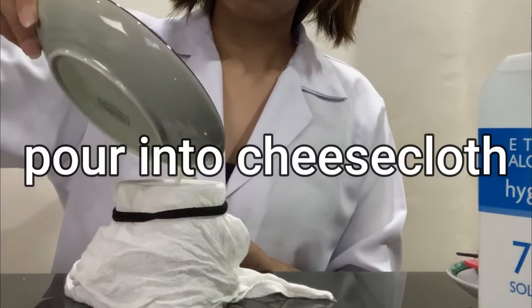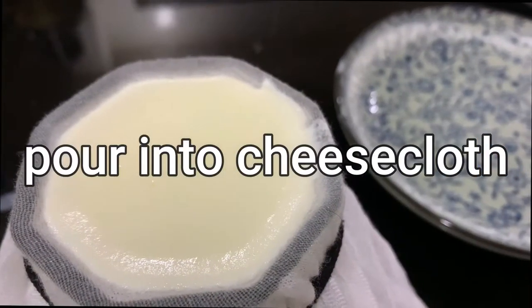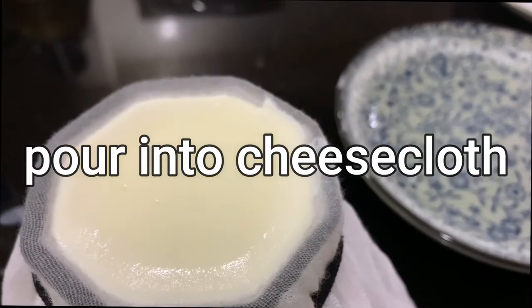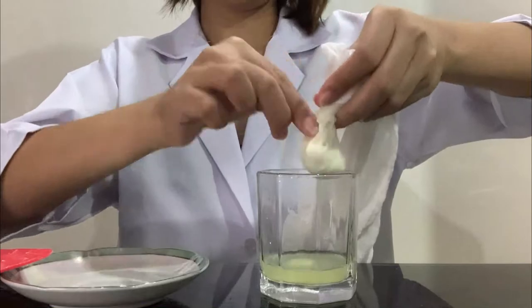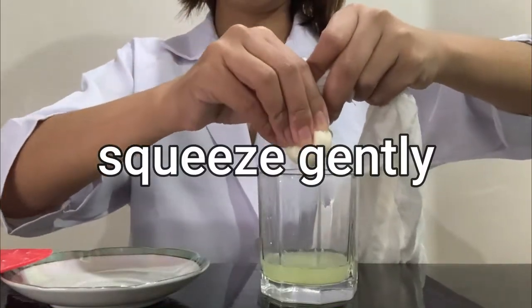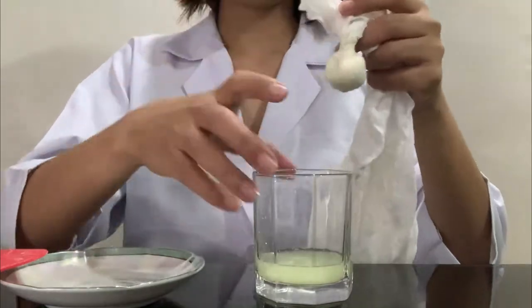When this happens, the casein will separate from the solution. Next, we will filter the mixture into a cup by pouring it through a cheesecloth fastened with a rubber band over the mouth of the beaker. Remove most of the water from the precipitate by squeezing the cloth gently, then discard the filtrate.